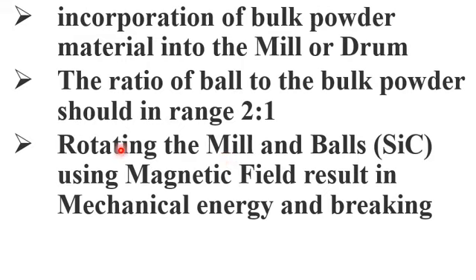Please note that the rotation of the drum of the ball milling apparatus is done externally. So externally the ball mill is rotated, and due to external rotation the balls inside the ball mill will impact the bulk material, and due to impact the bulk material will be converted into a fine nano powder.